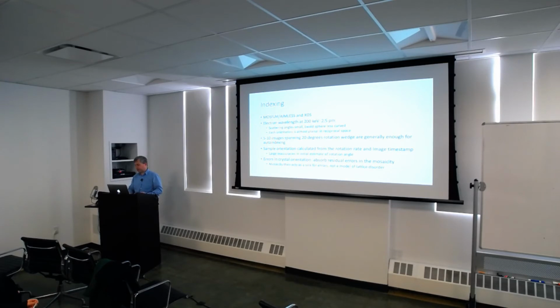But yeah, you just define which ones you tell the first bunch that you want it to index. And that seemed to work pretty well. It seemed to be pretty automated. It's been a couple of years since I did it, but you just told it and it figured out the indexing. Of course, it helped that we already knew the indexing, so you knew if you got the right answer or not. If you're doing something novel, then you probably have to be a little more careful.